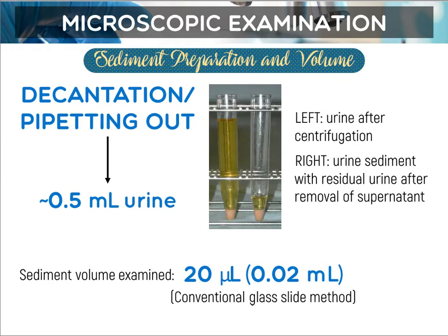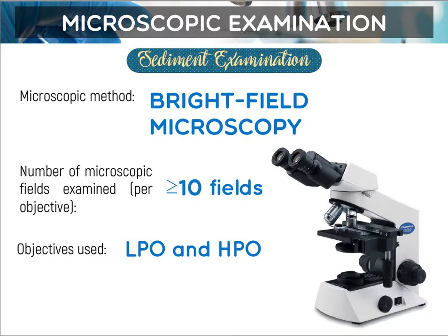So after getting the volume we have here, we resuspend the sediment by gentle agitation lang jud siya, guys, with your tube. Gentle agitation, dili vigorous, guys, kay para dili maguba or ma-disrupt ang ubang cellular elements. Okay? So, next we have your sediment examination.